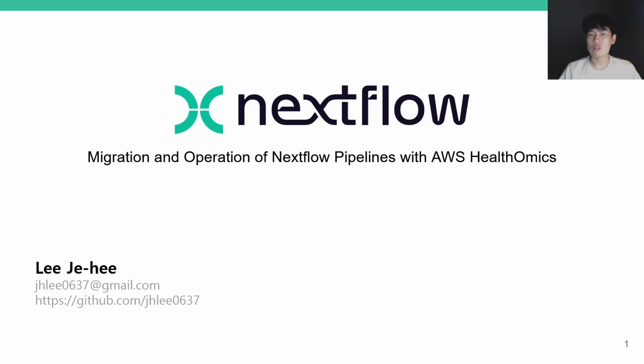This means I'm not going to tell you about the details of AWS, for example, how to create an EC2 instance or an S3 bucket. So if you're not familiar with AWS services, it may be a little difficult to understand this video. And if you're fine with this, then let's begin.